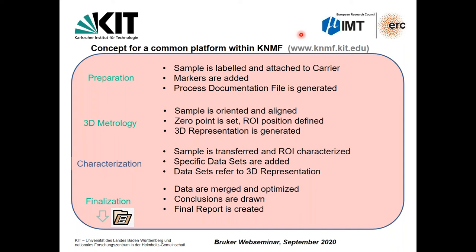Once you have that, you can take a sample and generate a 3D depiction of it, and then transfer this information to the next machine to address, on that representation, where your next measurement is going to be done. And at the end, you have data from different machines, from different manufacturers, in extremely different and varying formats.